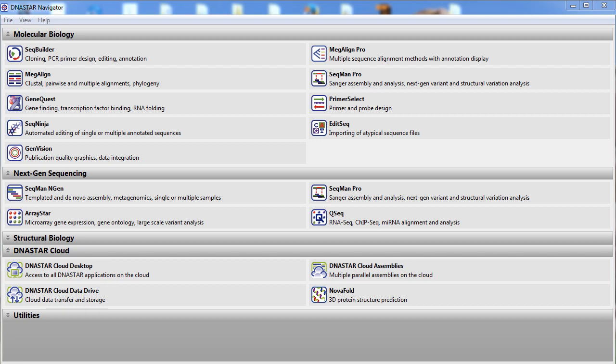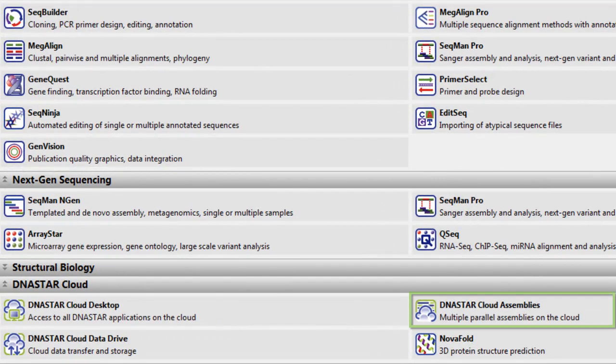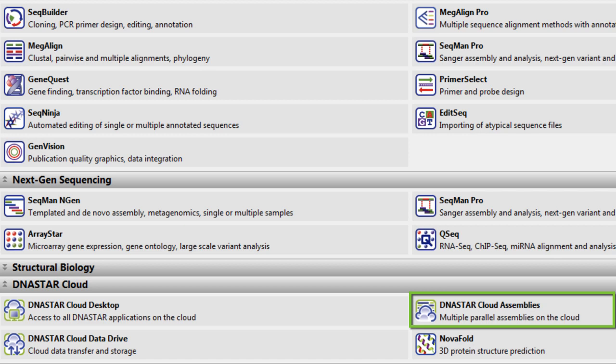Our DNA Star Cloud Assemblies tool allows you to quickly run multiple parallel assemblies on the cloud, alleviating hardware requirements from your data analysis.